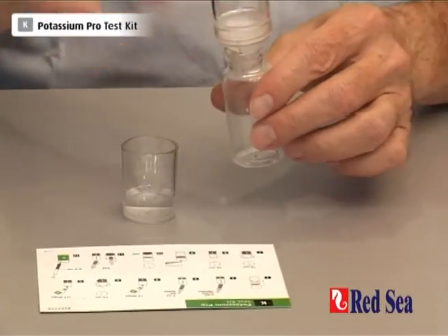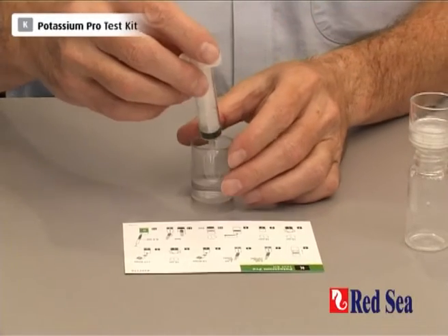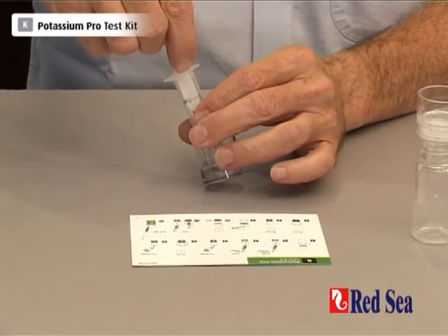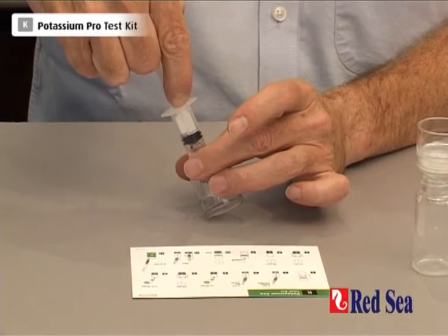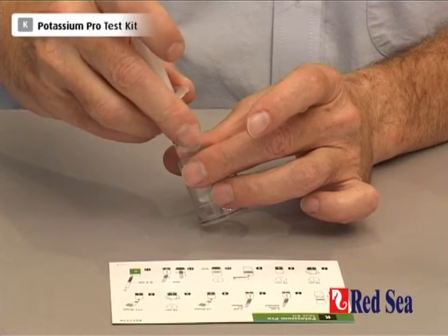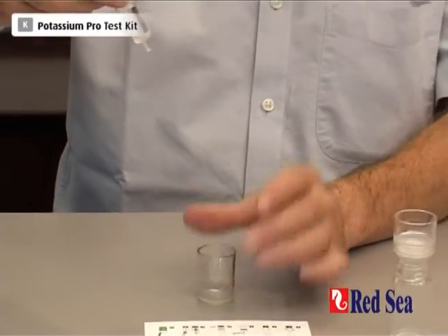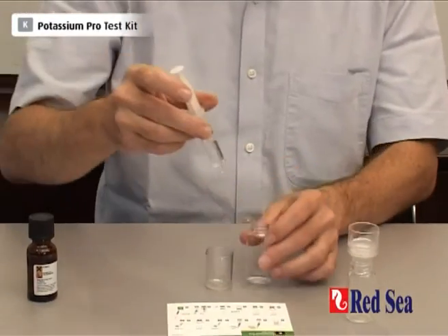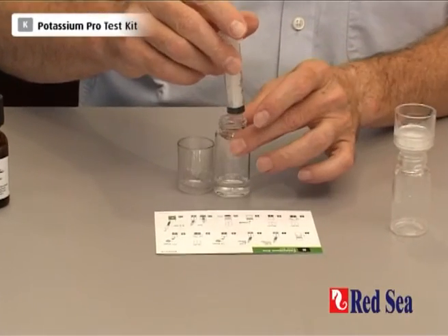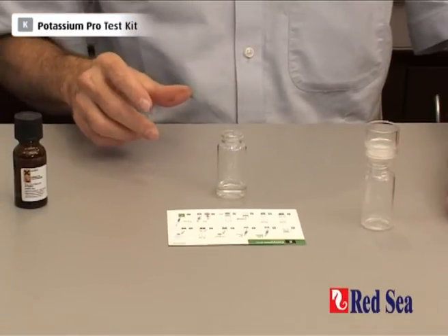So we can dispose of the remainder — we don't need it anymore. And with our 5ml syringe, we take out exactly 3ml of fluid. We put the 3ml into a new vial which we're going to use for the rest of our test.